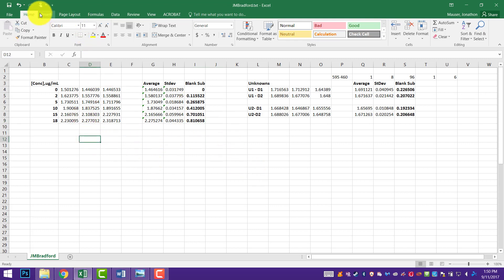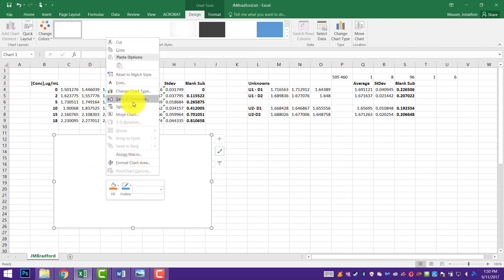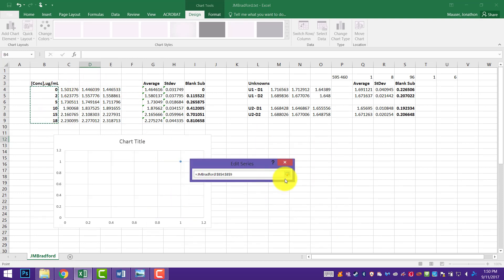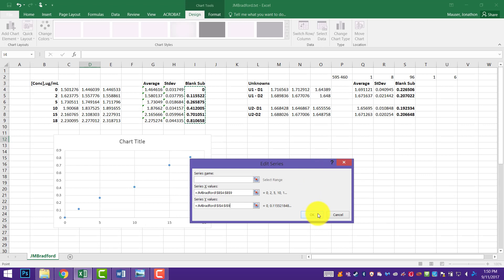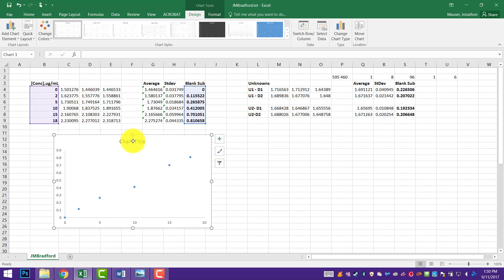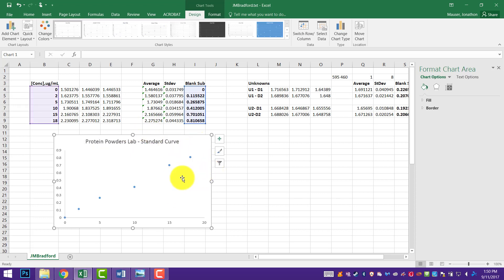Now it's time to start plotting our data. I'm going to add a new XY scatter plot and add my data custom to that. Add a new legend entry. My X values are my concentrations, and my Y values are my blank-subtracted averages for my standard curve. I'll get rid of some of the background — no vertical bars, no horizontal grid lines. I'm putting a placeholder title: protein powders standard curve. Remember that doesn't actually stay on there when you submit the graph.